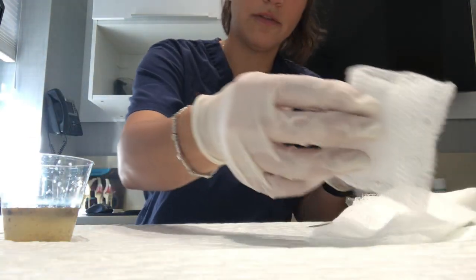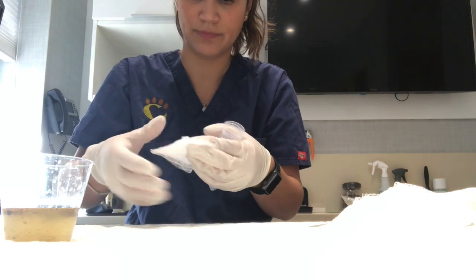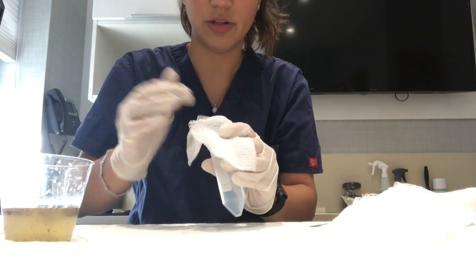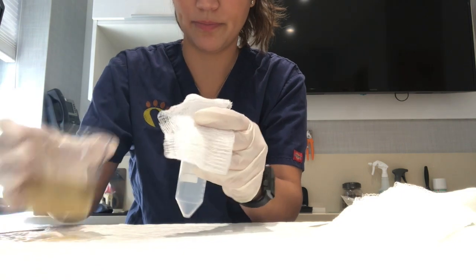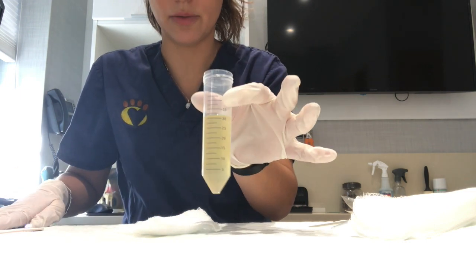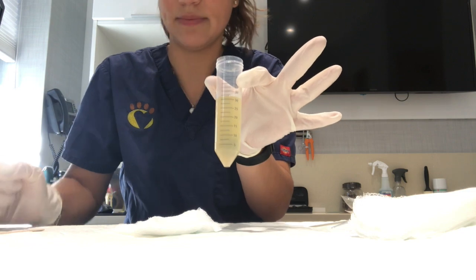Oh, I'm sorry. First, I need to strain it using our gauze. So I put the gauze right on top, just to make sure no large pieces of fecal matter go through. Great, now that we have this, I'm going to let it sit for 10 to 15 minutes.